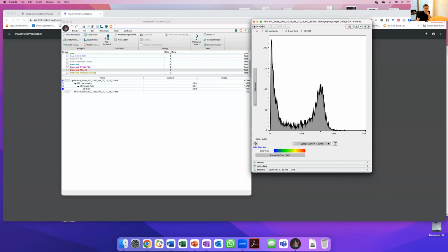So this is essentially, what, 100, 2, 3, 4. So this is around 100K. So double of that should be 200K, which would be here. And we're not. We're seeing it clearly in the 800,000. So this is clearly not a related peak. This is basically debris, cells without DAPI that haven't been stained. So we could conclude from here that the staining didn't go very well.